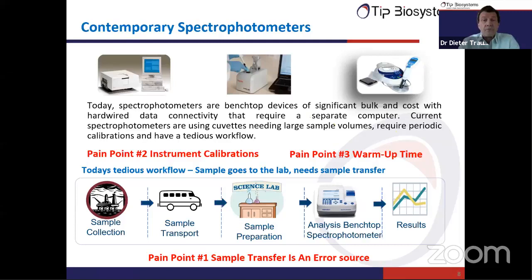Okay, so how do spectrophotometers look today? Here we also want to address some pain points that were submitted. Typical spectrophotometers today are benchtop instruments, like in this picture. You see them here on the top, and for decades and decades, that was the standard. And there were, in my personal opinion, 2 big advancements in spectrophotometry.